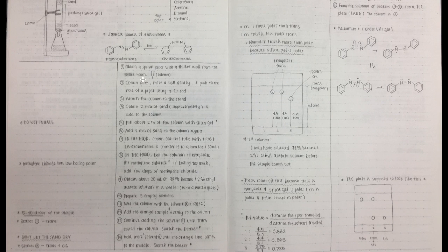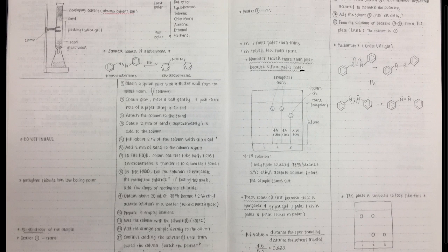Also, I know that the cis isomer will be the last to exit the column, and in order to help the cis isomer to leave the column, we need to increase the polarity of the solvent. The student even drew a mechanism of how the trans azobenzene becomes the cis azobenzene.